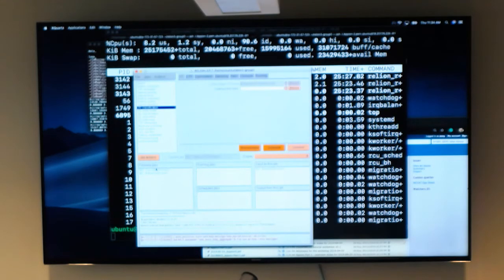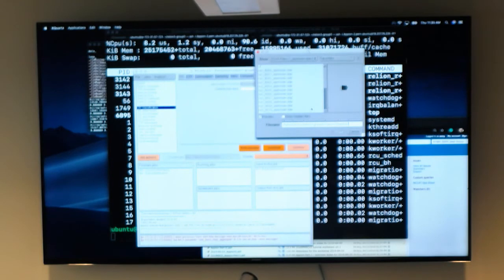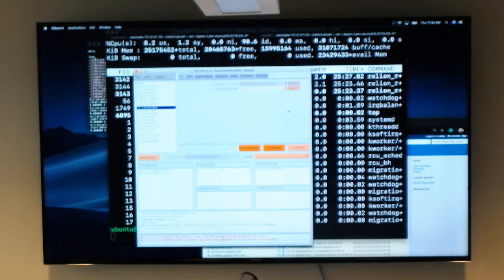So don't feel that because I said to do 50 iterations, I have to wait for 50 iterations. Or it might be the situation that I did 50 iterations and 50 iterations are not enough. I need more than 50 iterations. You can always tell Relion to say, I've only done 22 iterations because I killed it before 23. Resume starting at 22.